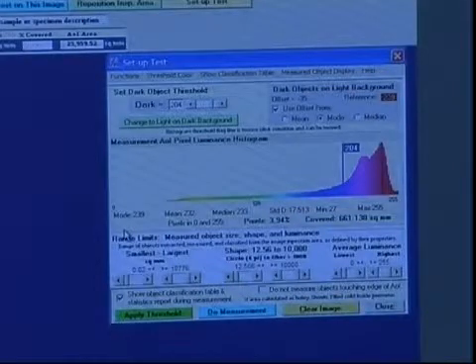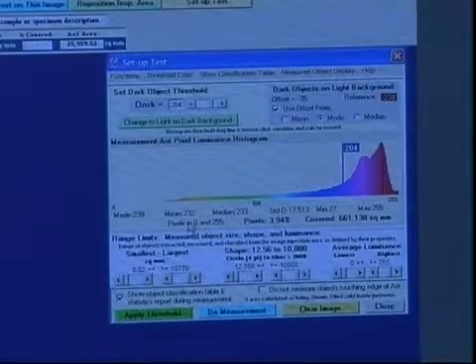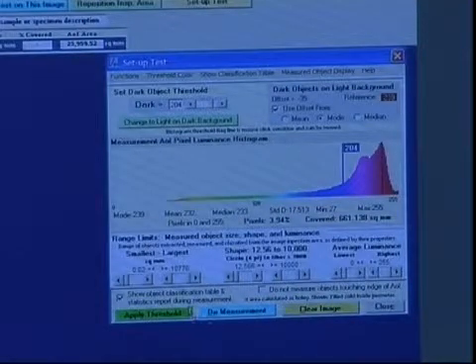The mean is then recalculated within the standard deviation so that we're narrowing down and eliminating most of the dirt when we recalculate. So the mean may be more typical of the background than the mode in many cases, but we'll stick with the mode in this particular example.